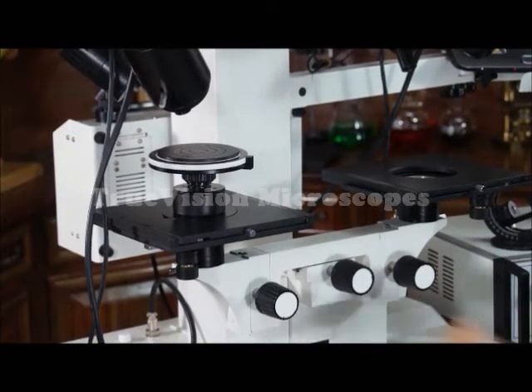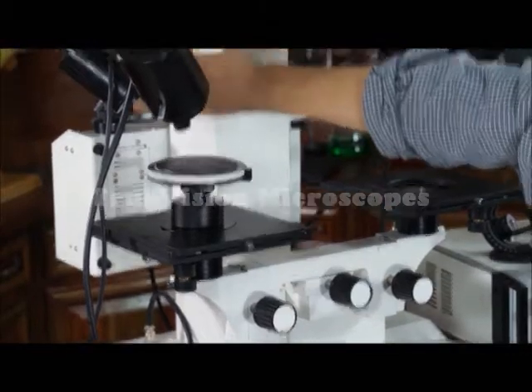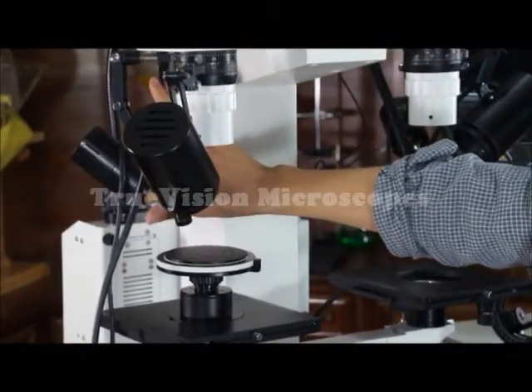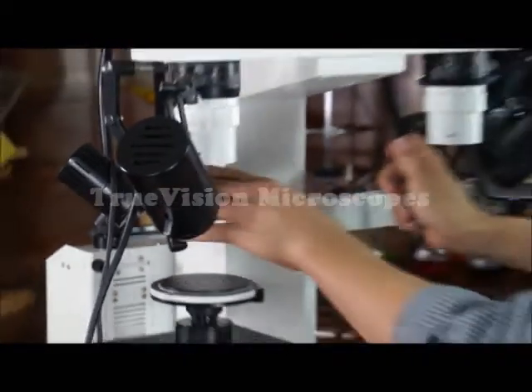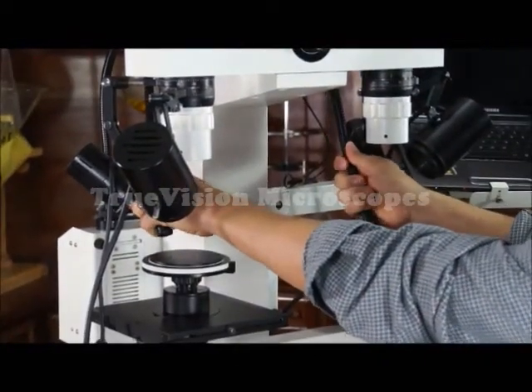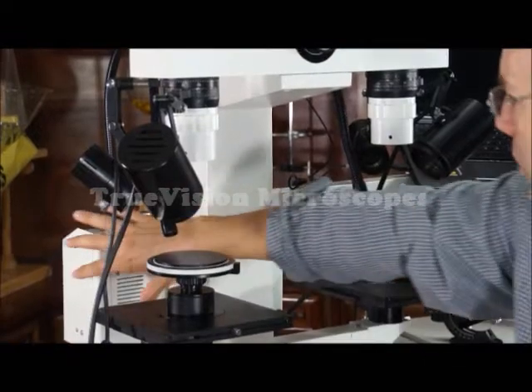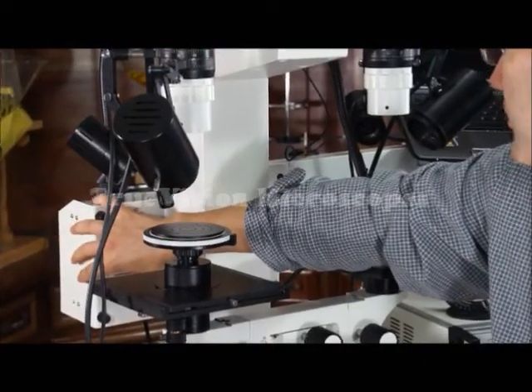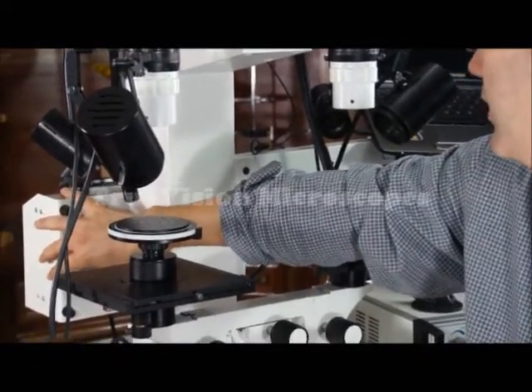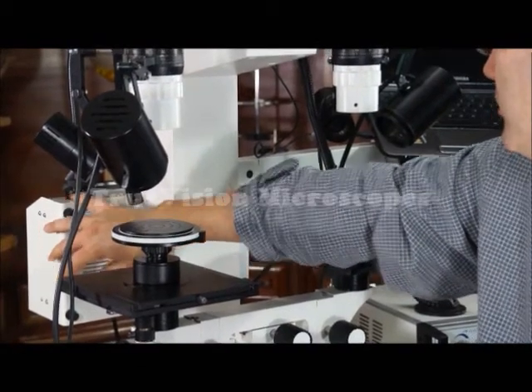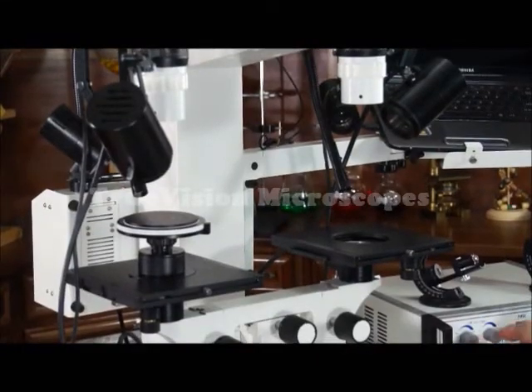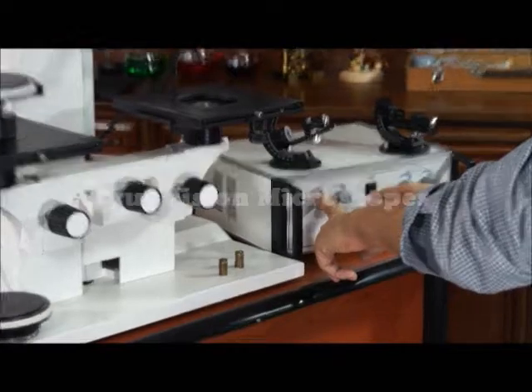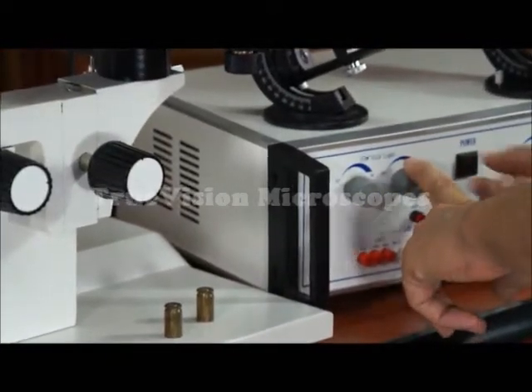I have various illumination methods. We just discussed the fiber optic, where I have 150 watt fiber optic illumination on both sides. It's controlled by a rear mounted fiber optic light source halogen 150 watt bulb. The intensity is controlled by these knobs, one operates the left system, the other operates the right system.